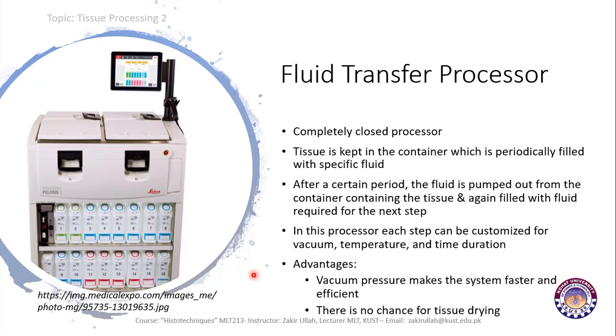The advantages of this fluid transfer processor over the tissue transfer processor is that the vacuum pressure makes the system faster and efficient, and there is no chance of tissue drying in this processor. So these are the advantages of the fluid transfer over the tissue transfer processor.